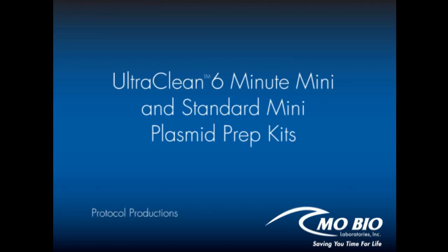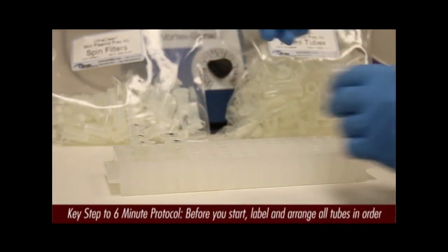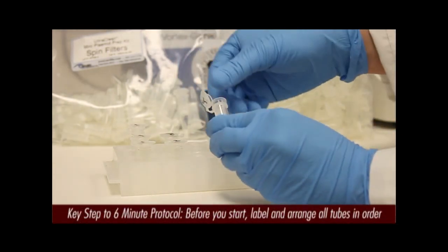This video describes how to use Mobio's 6-Minute Mini and Standard Mini Plasmid Prep Kits to isolate high-quality plasmid DNA. Grow your plasmid culture to a typical density of A600 equal to 2.0 or higher.